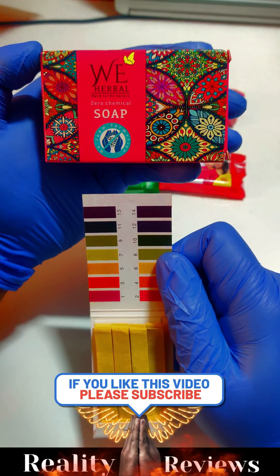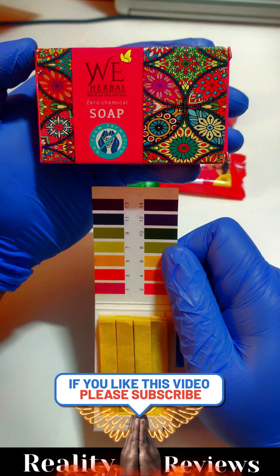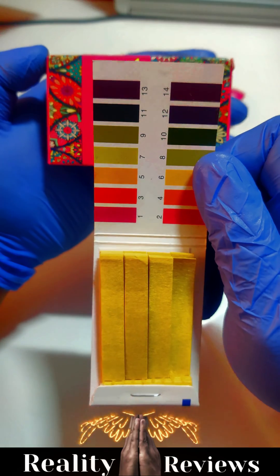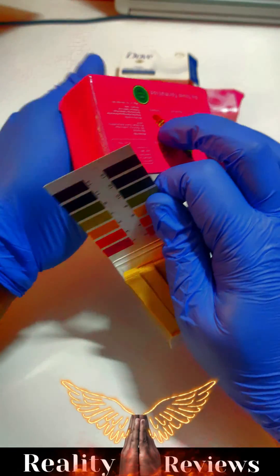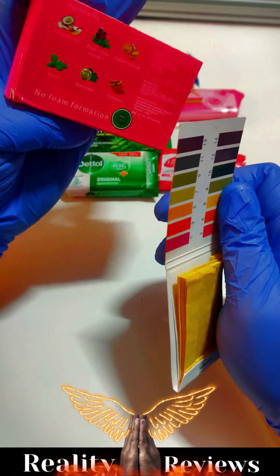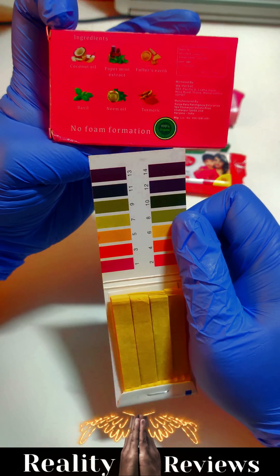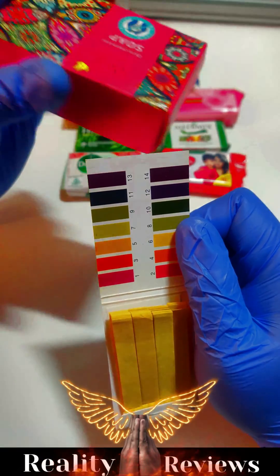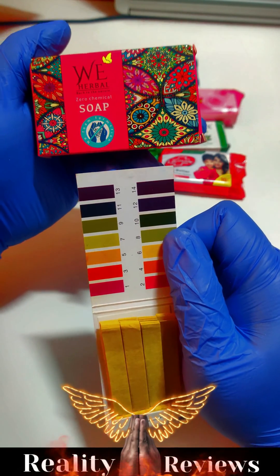Hello everyone. In this video we're going to check if V Herbal Soap, a zero chemical soap, is safe to use or not. A pH value between five to six is safe to use, and as per the ingredients, all of them look herbal and organic, with no foam formation. Let's check if the pH value comes between five to six and is completely safe to use.